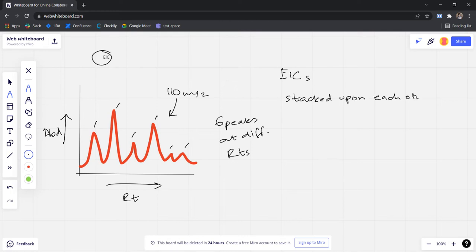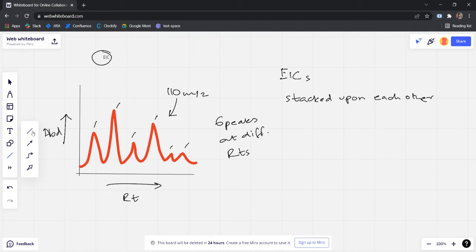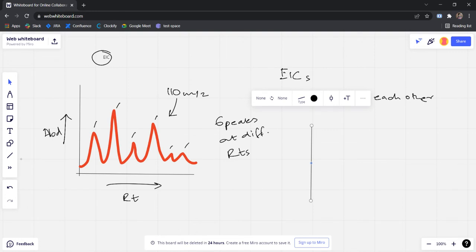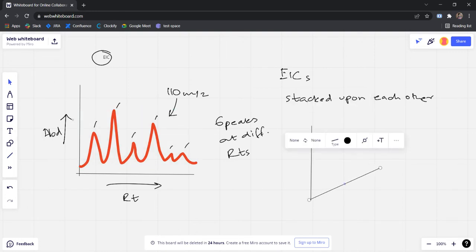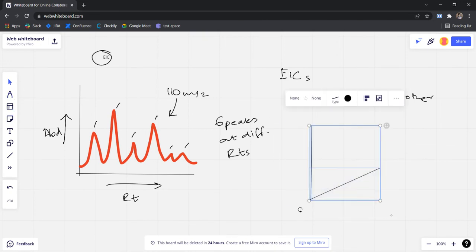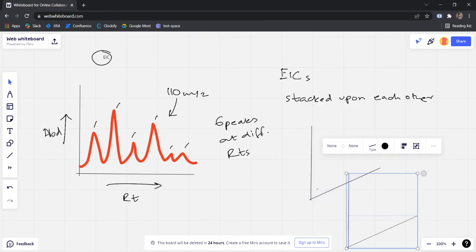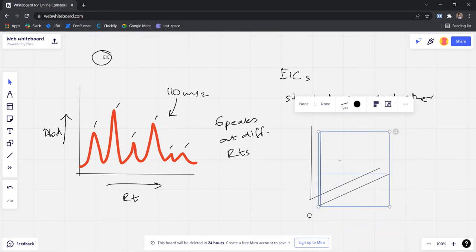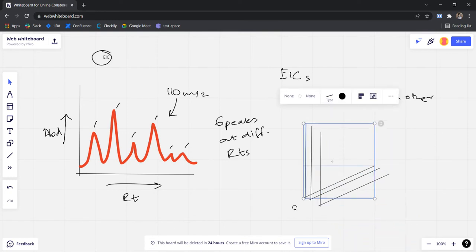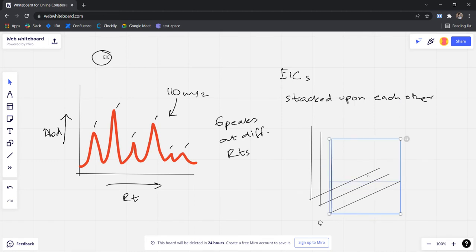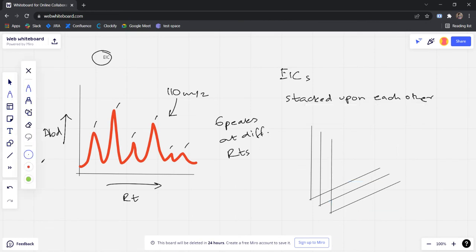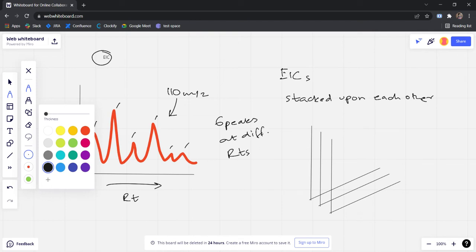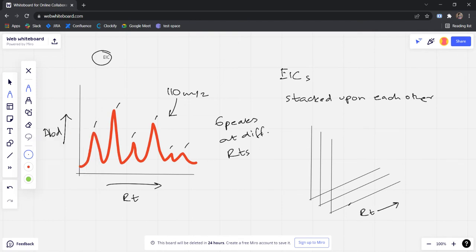Now to visualize this, I'm going to draw three EICs somewhat like this, and they are basically stacked upon each other. So let me just select this and copy paste. This is one, this is another. For simplicity I'm just considering three. And here now I have three dimensions. Number one dimension here is the RT. Number two dimension is the abundance, this vertical axis. RT is this axis.